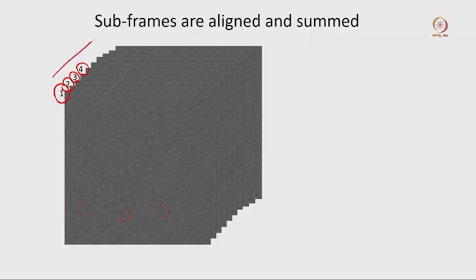So we are collecting a total of 40 frames, and based on features where we have some kind of marking, I can see some kind of pattern. I try to align the first frame with the second, then the second with the third, fourth, fifth, and keep going, and bring it back to make an integrated image.